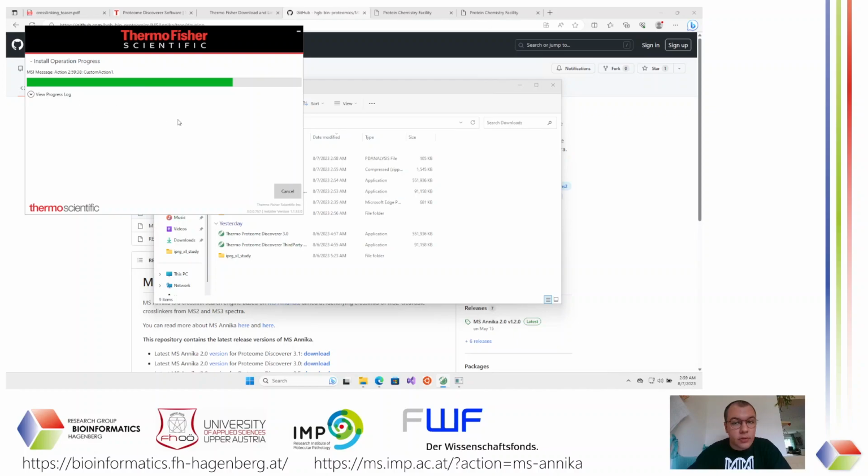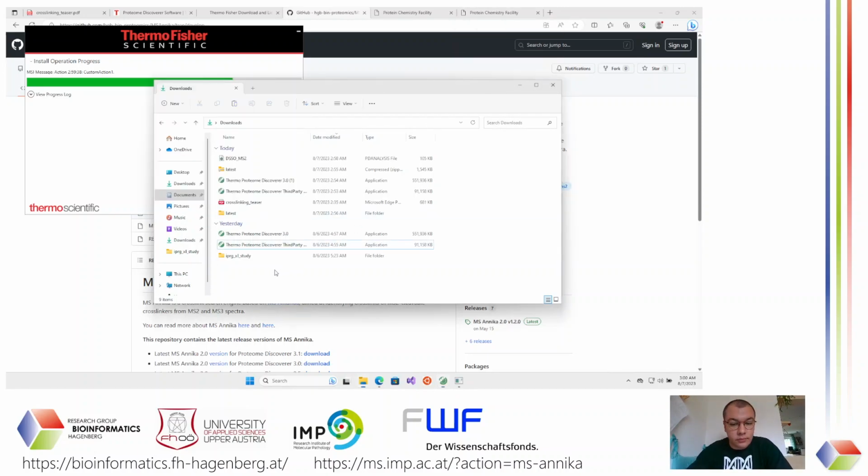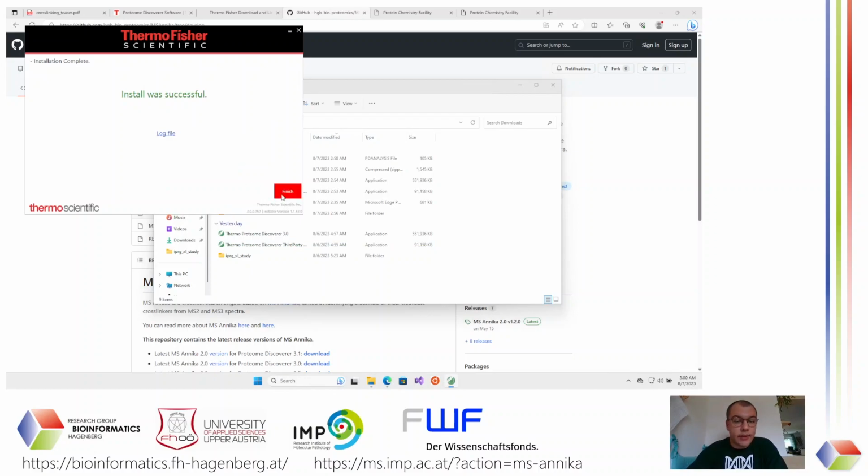Yes, this should only take another minute, hopefully. Yes, and that was successful.